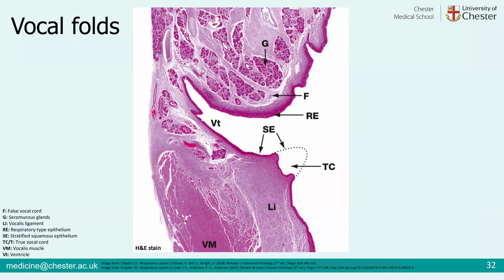I don't know why, if you were going to make a textbook, you'd not have the best picture you could. This is a picture in the textbook and they go, oh, by the way, part of the vocal cord is missing. You couldn't have found an intact one, could you? So the outline is where the true vocal fold was. I couldn't find a better one.